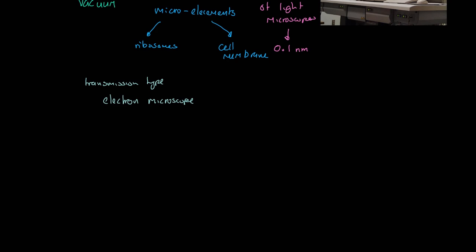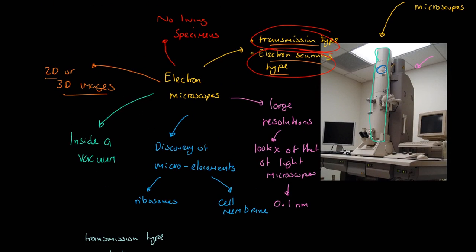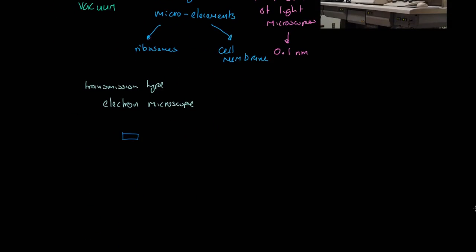My favorite bit is right at the start of our microscope. Picture this maybe up at the top of our microscope. We have this little object which I'm going to refer to now, and get ready for the coolest name ever, as an electron gun. That's the fundamental here. What the electron gun is actually going to do, not surprisingly, is fire electrons, and it's going to fire them like this. But where does it fire them?